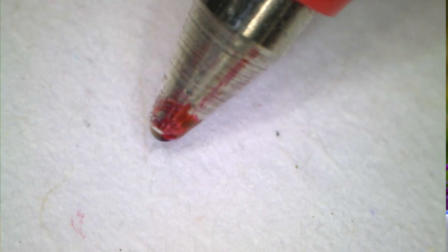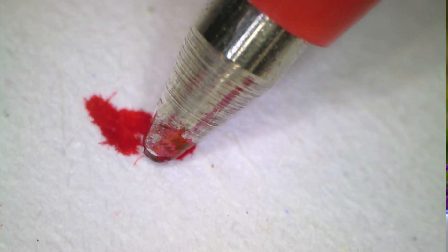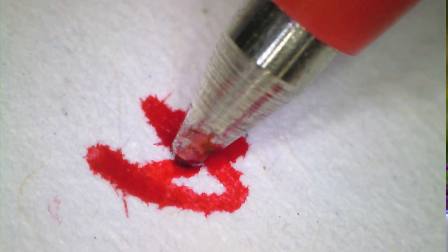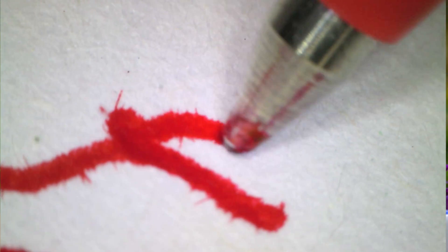This is quite interesting — I've done this before. This is a pen, a biro. Let's get this focused in and you can actually see the ink. Let's get the pen going. Look, you can see the ink going into the paper. You can see the little fibres in the paper and how the ink goes in. And if I turn it around, look in the end of it — there's a tiny little ball. There's a ball bearing in the end — that's how they make it and that's where the ink comes out.